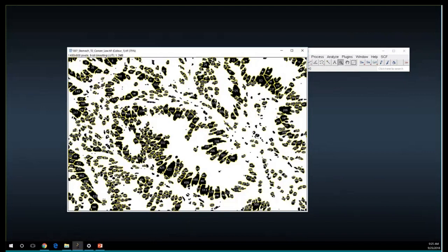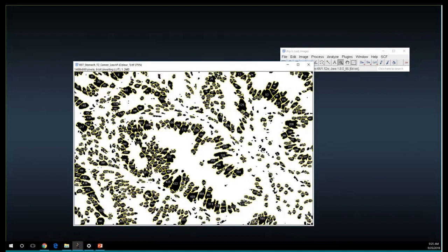Okay, so now you save this number. You might want to save also this image for later use and comparison with maybe a revised version if you want to revise it, stuff like that. So that's the first step to detect nuclei and count them. Now let's move on to the next step, which is how we can detect the probe and count the particles there.